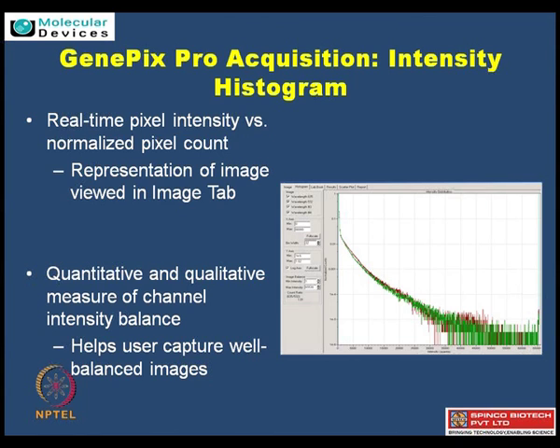I guess now it's time that we should really move on to your software interface and just see how really the scanning is performed by using this software. Yes, let's switch on to the GUI. Okay, Pankaj, so let's talk about the software and how actually we can use the software for image scanning from the hardware, so that now we can see live how one can actually control different buttons for acquisition of good images. Let's go to the GUI. Sure.